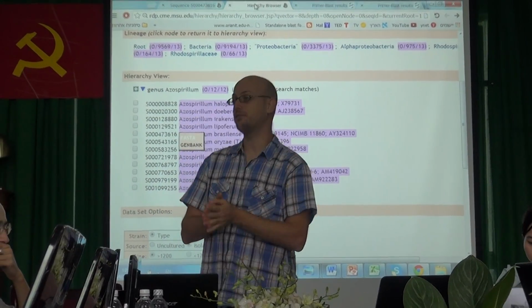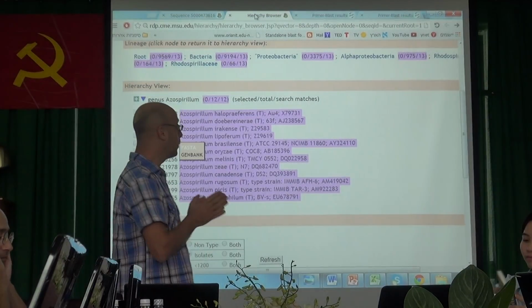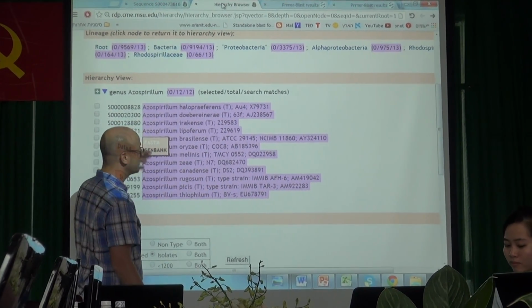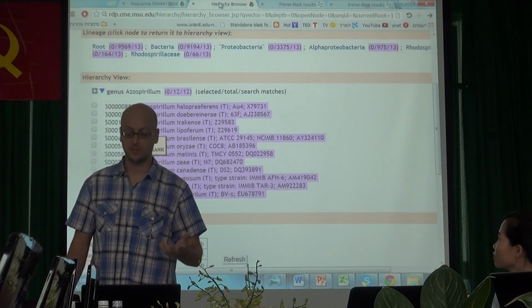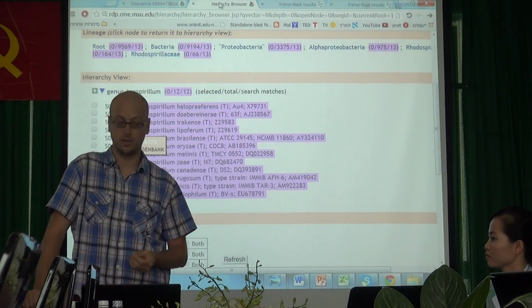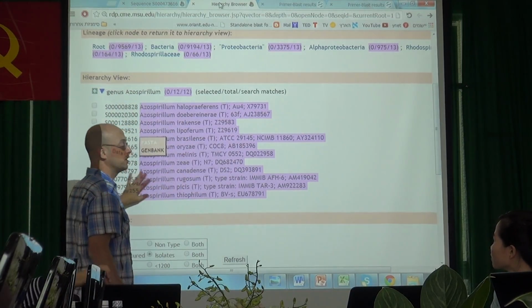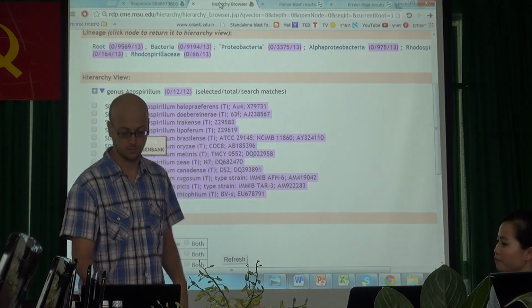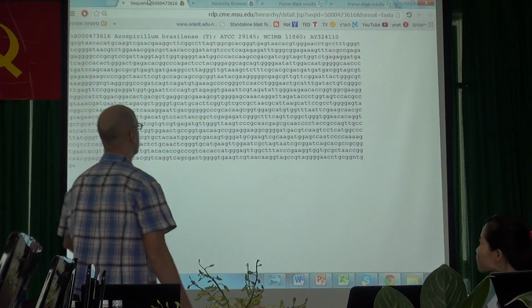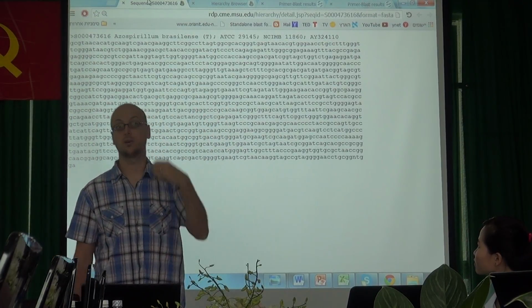Wanting to identify bacteria. And the way to do it, we said, first we need to know the 16S sequence of our target bacteria. And we did that with the RDP database. So, we got the sequence of our target.